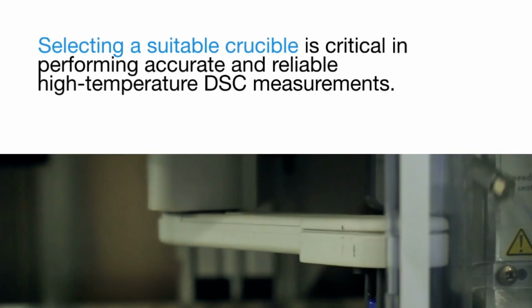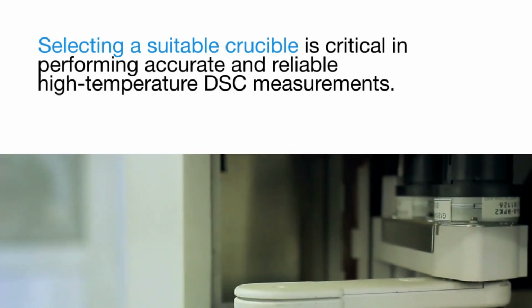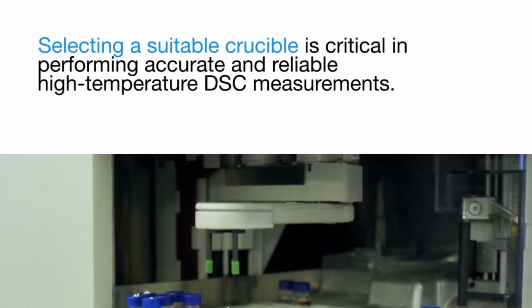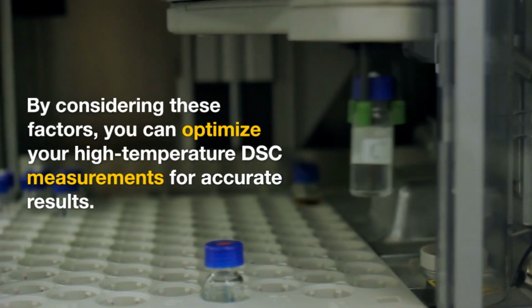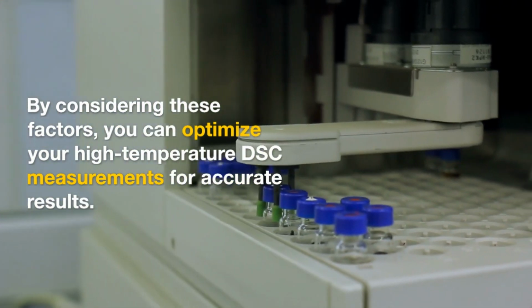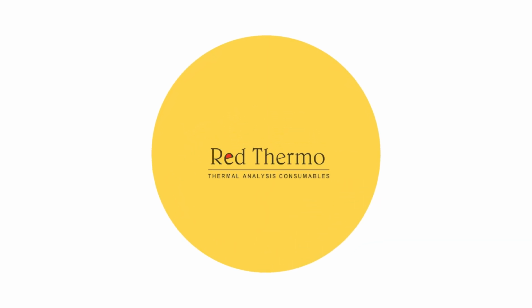Selecting a suitable crucible is critical in performing accurate and reliable high-temperature DSC measurements. Consider the material compatibility, temperature range, thermal conductivity, design considerations, sample capacity, and other factors discussed in this article. By making an informed decision based on these critical factors, you can optimize your thermal analysis experiments and obtain meaningful results.